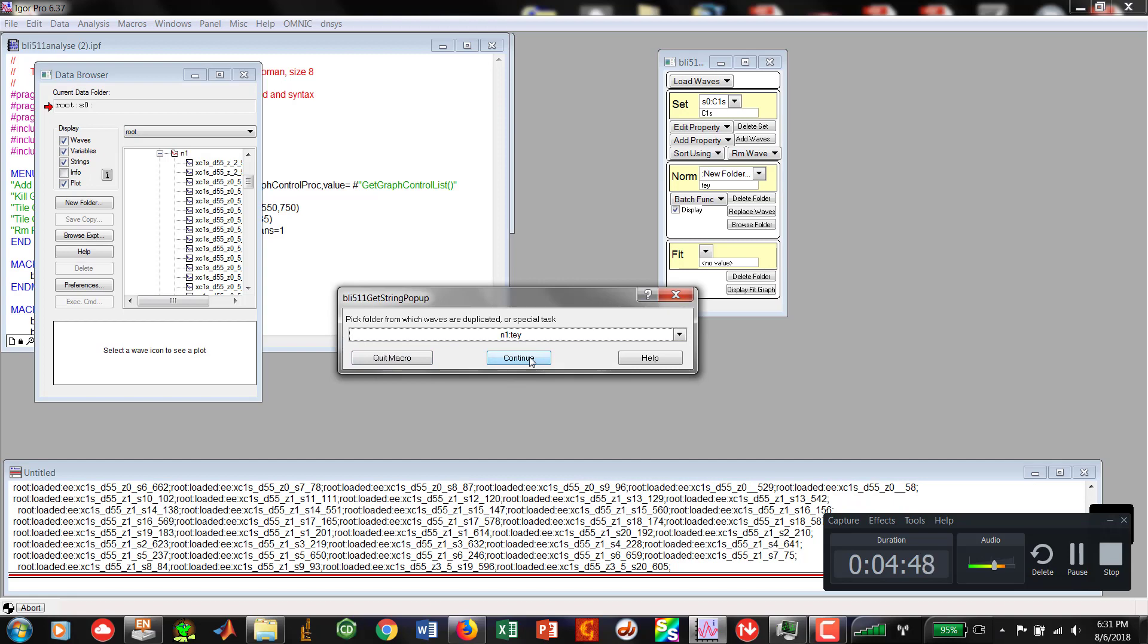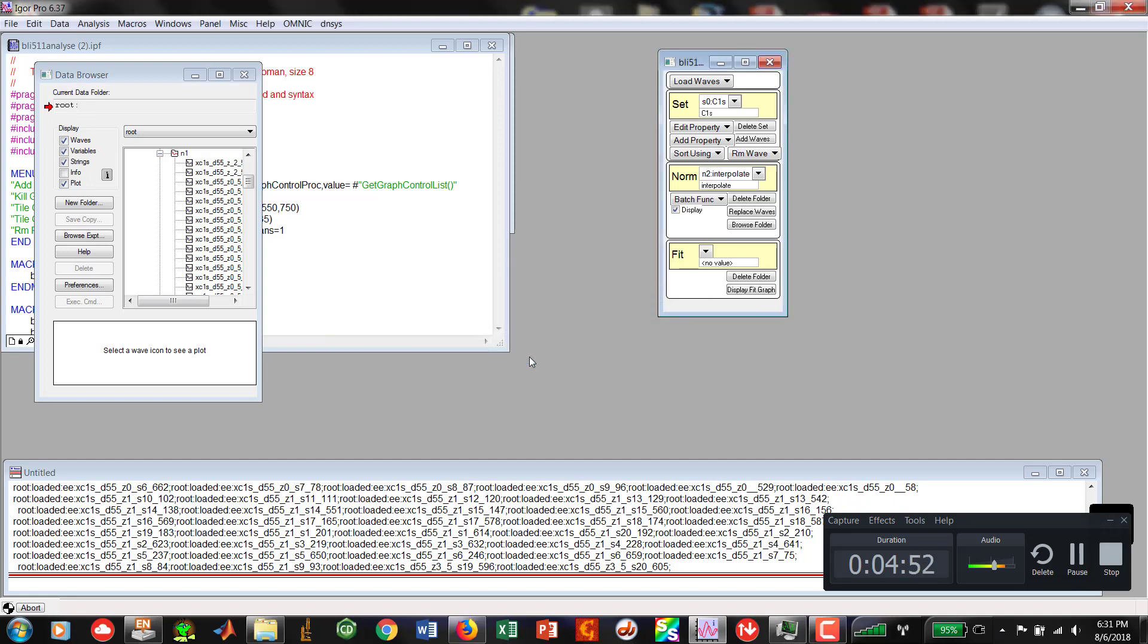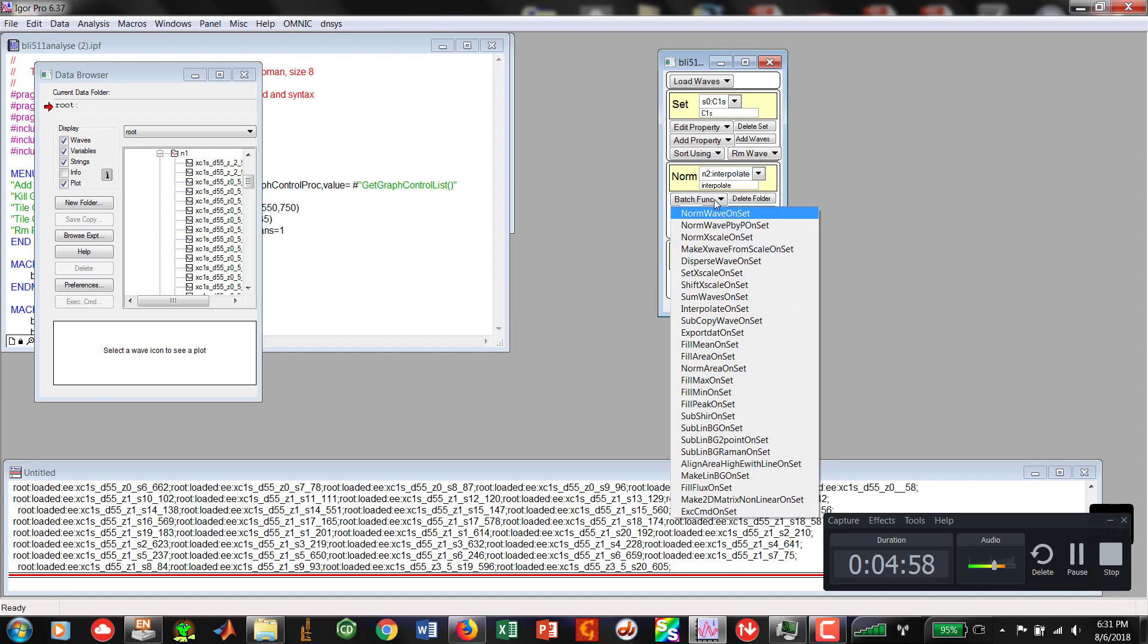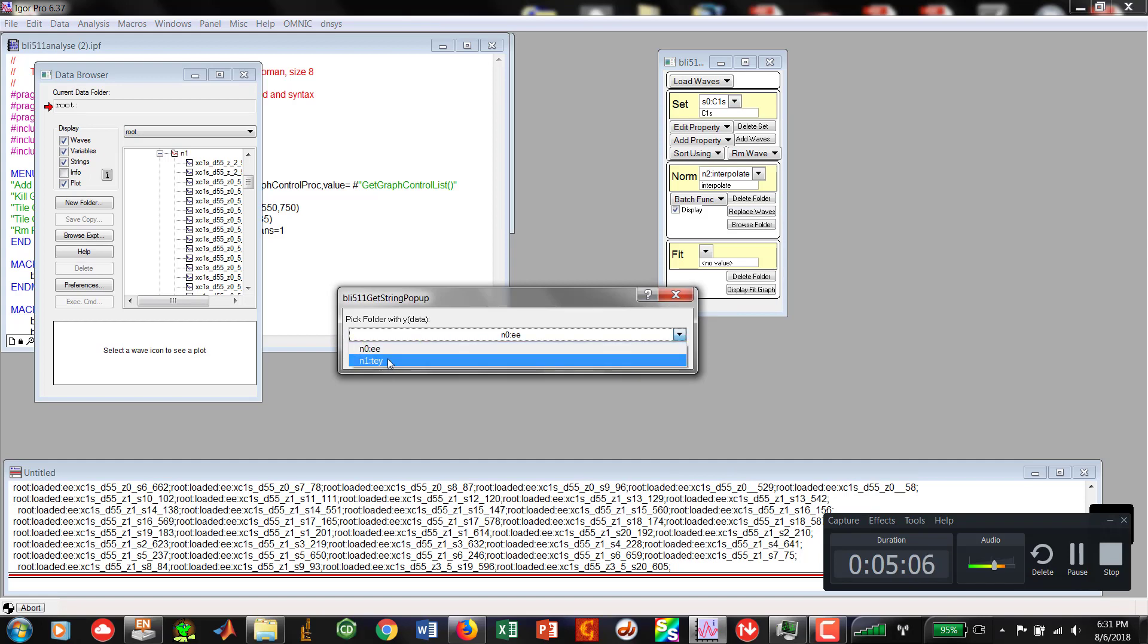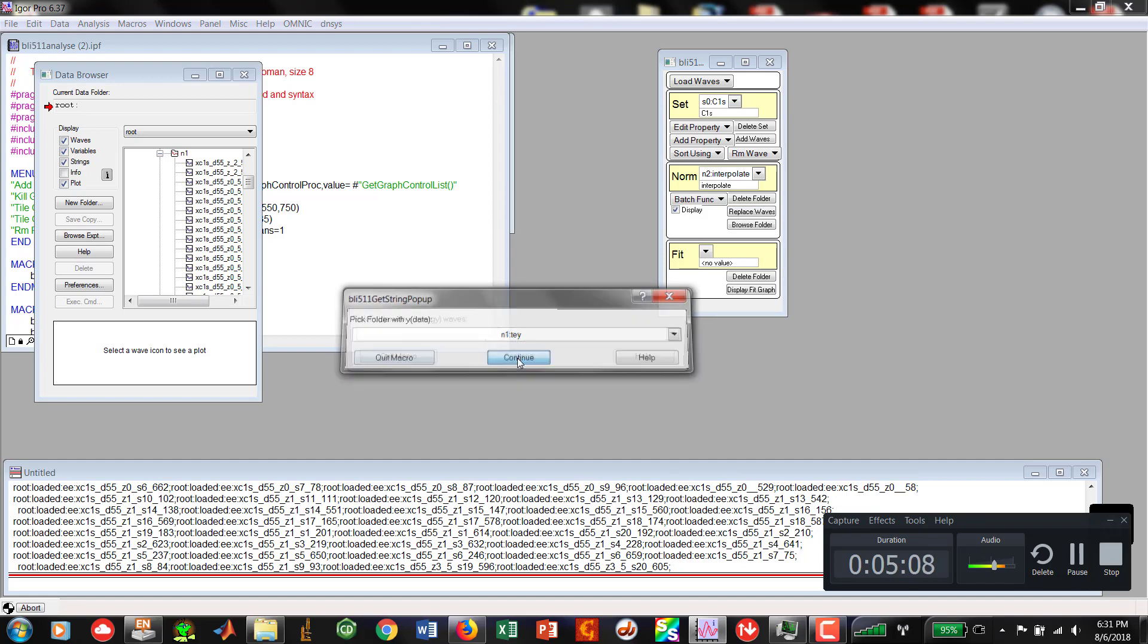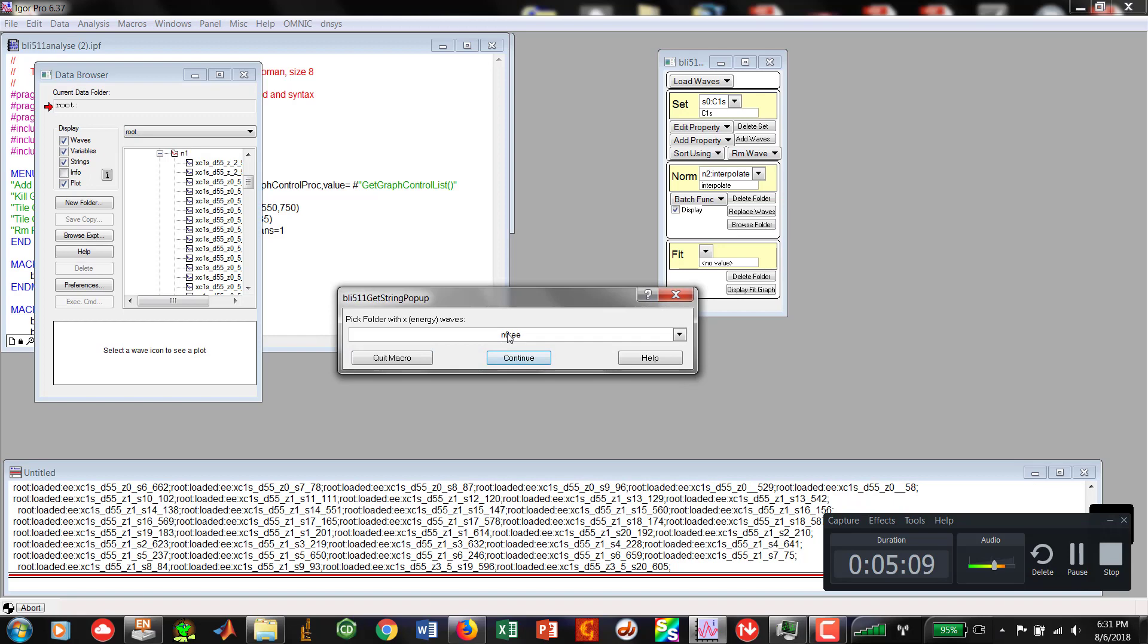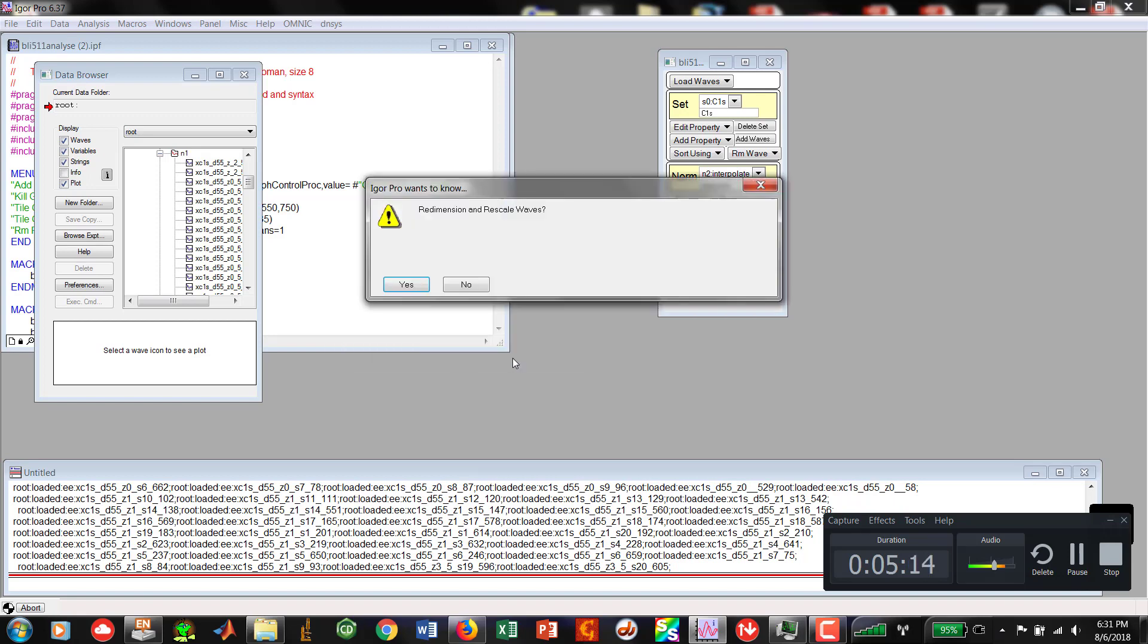We could do N0 also because we're going to end up manipulating this interpolation file anyway. So now we've got N2 interpolate and we're going to use the batch function and we're going to say interpolate on set. Pick folder with Y data. That's our TEY. Hit Continue. Now X waves and not our EE data for the photon energy.